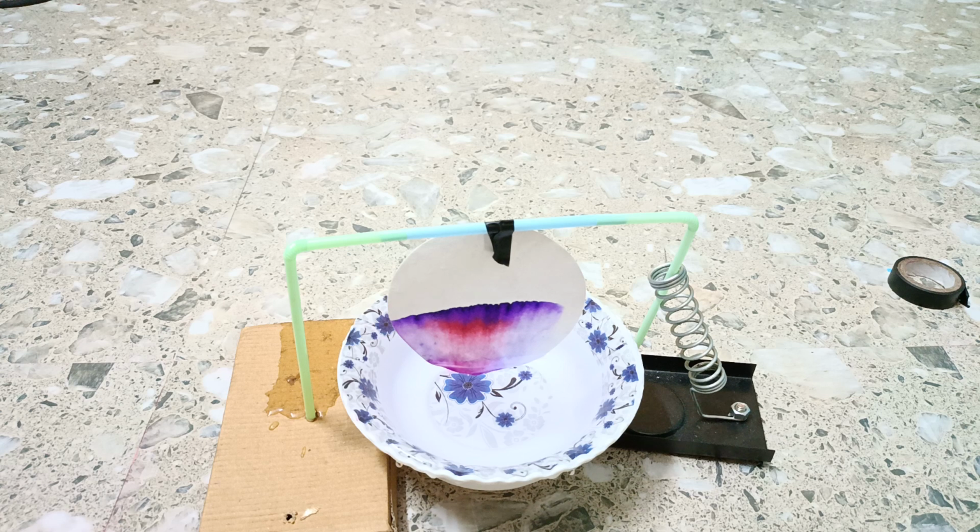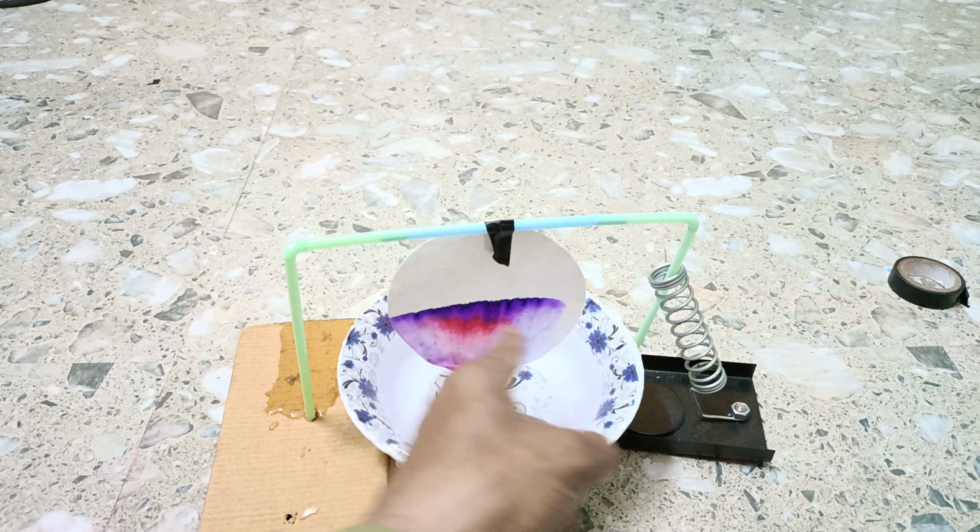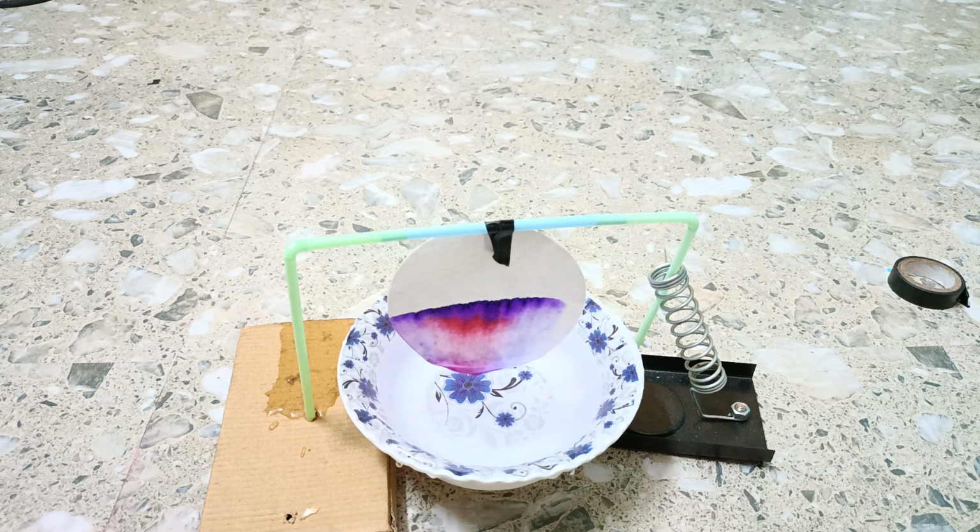In paper chromatography, water molecules present in the pores of the filter paper act as the stationary phase, and the moving phase can be a solvent like hexane, toluene, acetone, or a mixture of solvents such as methanol and water, etc. In this way, we can separate the blue color and red color by the method of paper chromatography. Dear friends, this is what we call paper chromatography. You see here, we can separate the two colors. One is red, this is a red patch of color, and this is the blue patch of color. We have separated the two colors in this method, and the method is known as paper chromatography.